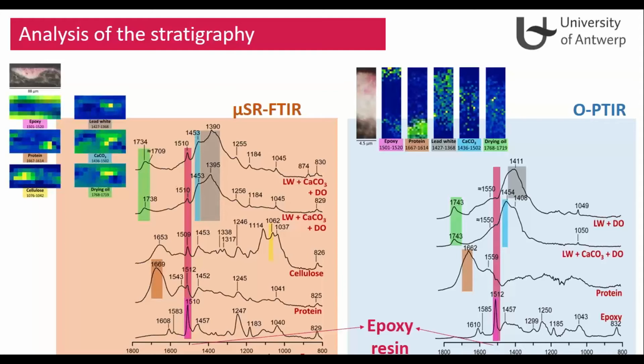And the explanation for this is that because the spot size analyzed in synchrotron IR is bigger, it was difficult to analyze only areas that were exactly inside of the sample. It was easy for the analyzed areas to include small regions of the embedding resin, or regions close to the edge of the sample where the embedding resin has infiltrated.